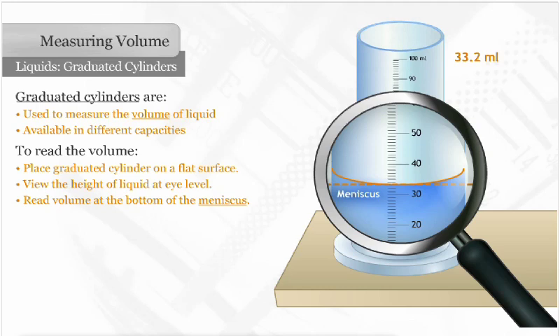Since the volume can be read to one-tenth of one milliliter, two people may read the same measurement and record different answers. One person may record the volume of this liquid as 33 and one-tenth milliliters, and another may record 33 and three-tenths milliliters. According to the reading error, both are correct.